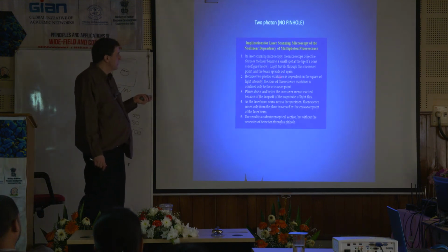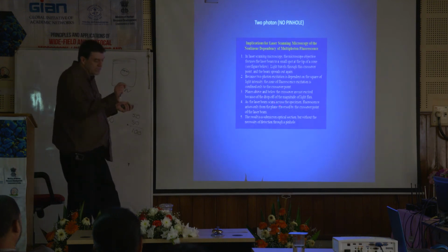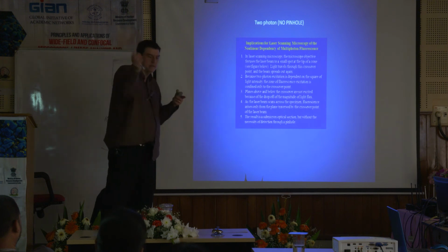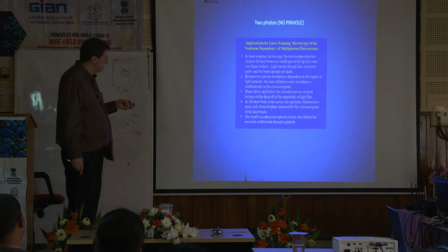in 2-photon, it just matters where the light hits. Because it's only going to excite, it's not going to excite above it, it's not going to excite below it. It's only going to excite where those 2 photons meet. It's not going to excite anywhere else, because the energy is not enough to excite anything else. So it only excites where the 2 photons hit. That's the main takeaway from this whole slide. Okay.